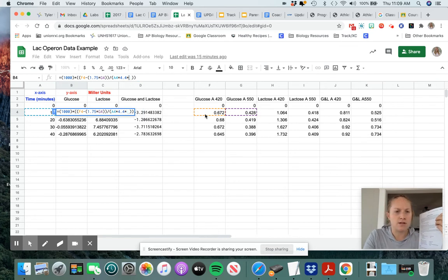Okay, so you can just take that and say you had 0.997. Okay, that's your measurement. Then you just hit enter, and if you go back there, you can see it's still changed. I changed that number, and it will change the output number there too.